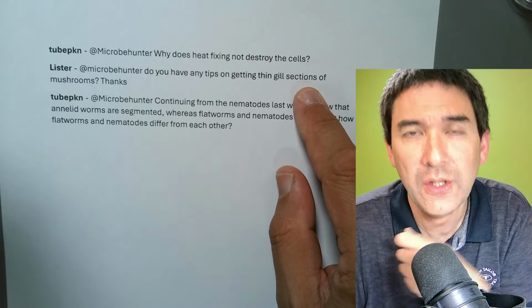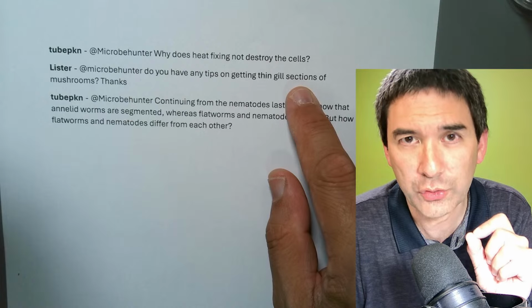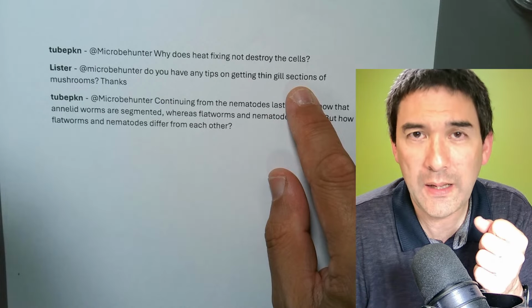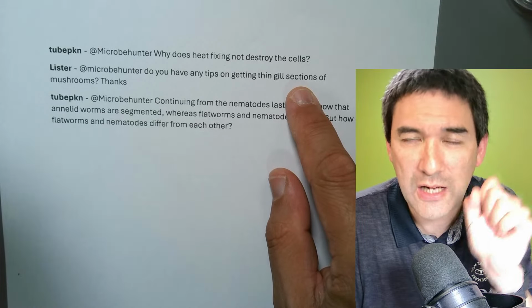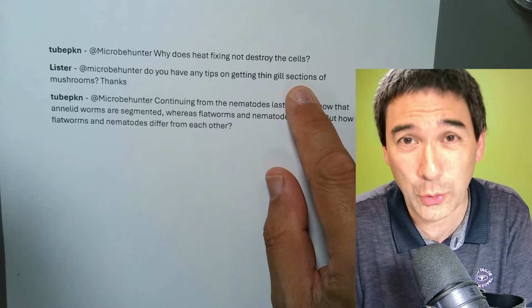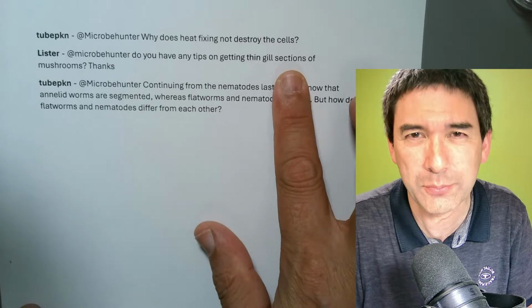I took small samples of the gills and compressed them between a cover glass and a microscope slide. Then sometimes you're able to see the parts that are actually making the spores. Otherwise, you'd probably have to embed it somehow and then microtome it, but that is quite a fancy and complex procedure.